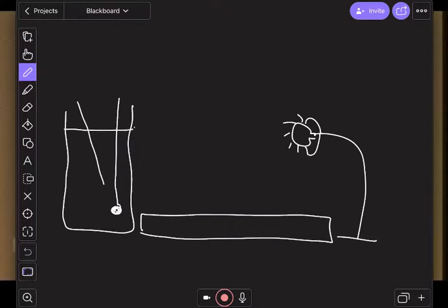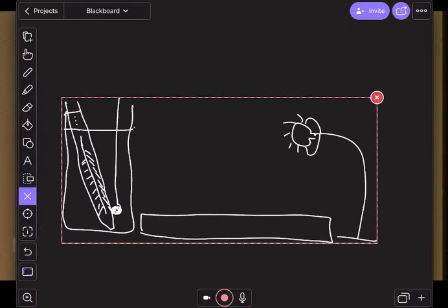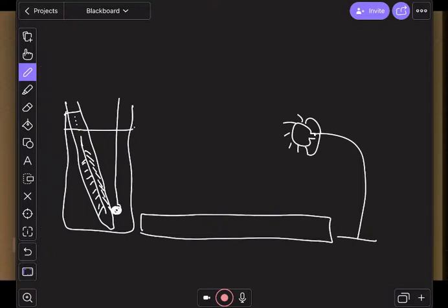We are going to put our test tube in here, and we are going to put our pondweed down here, and we are facing it stem up, such that we can now see air bubbles. So in terms of our labels, I'll change the color of the pen. So we are going to count bubbles per minute. So that's going to give us our rate.